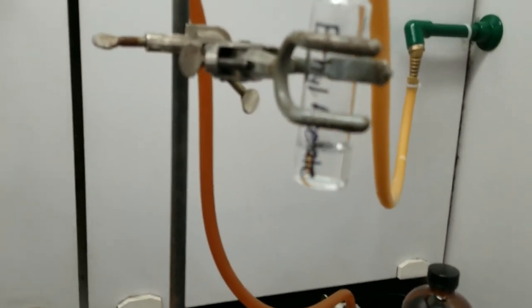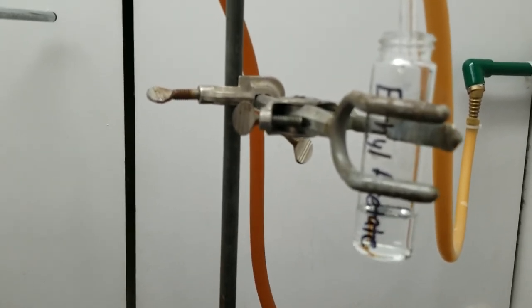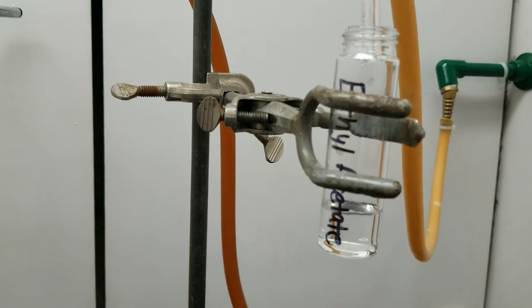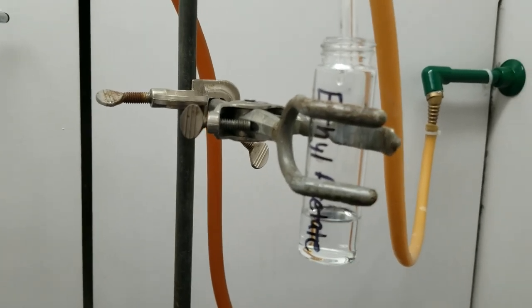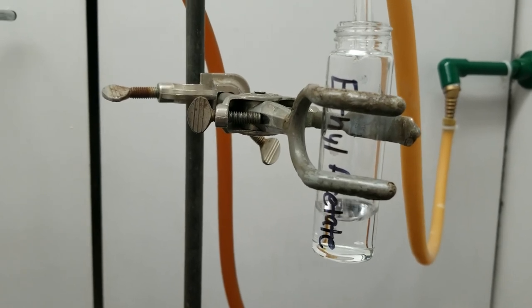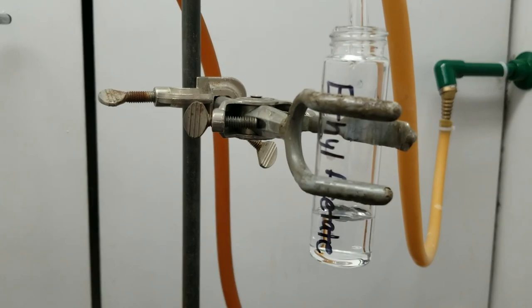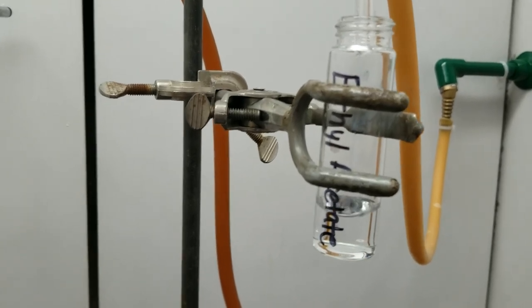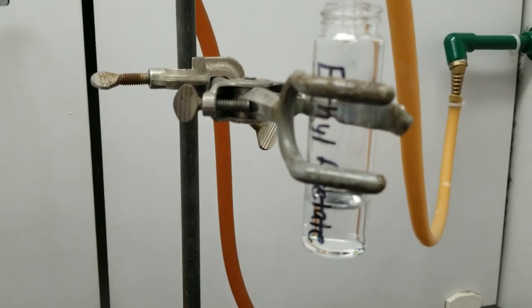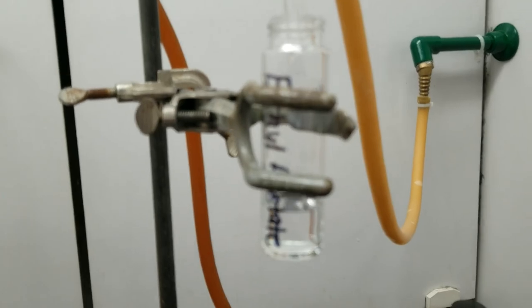So I'm going to continue to collect this, keep an eye on the thermometer, and I will let you guys know what the final mass of my ethyl acetate is. That will allow you to go through the density to get the volume of it. And then we can determine the volume ratio of toluene to ethyl acetate that was in the original sample, assuming that the rest of the volume was toluene. So we'll get that to you soon.